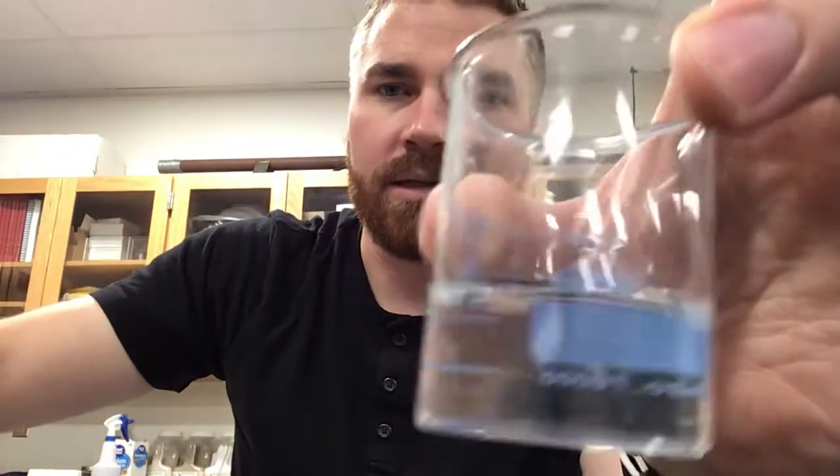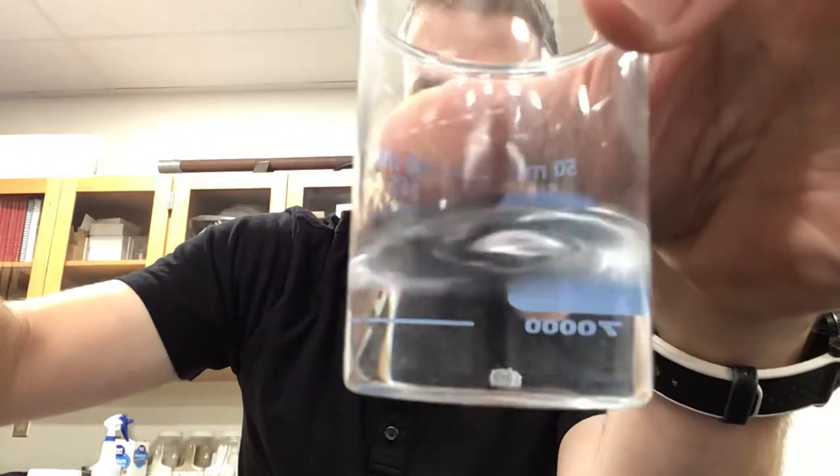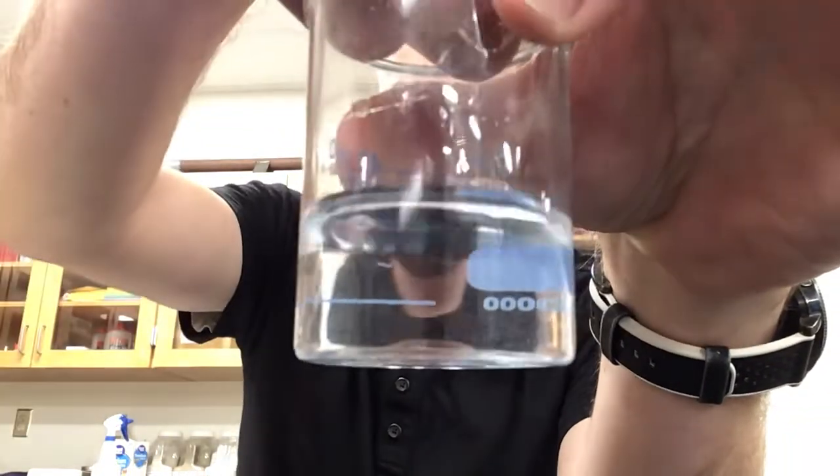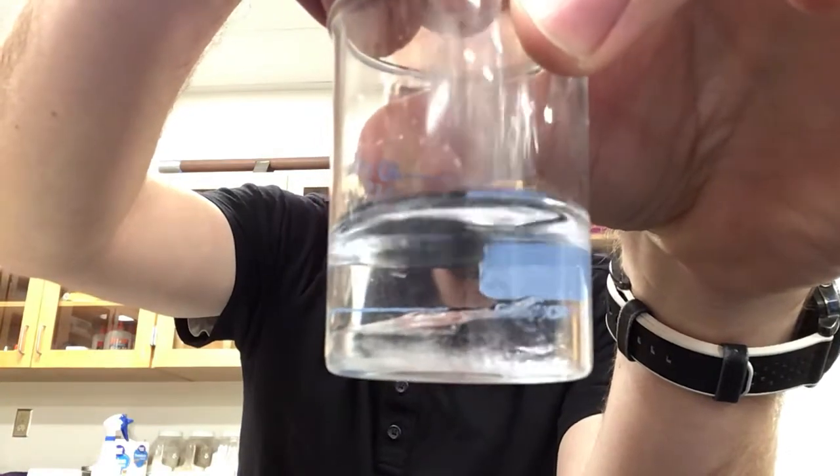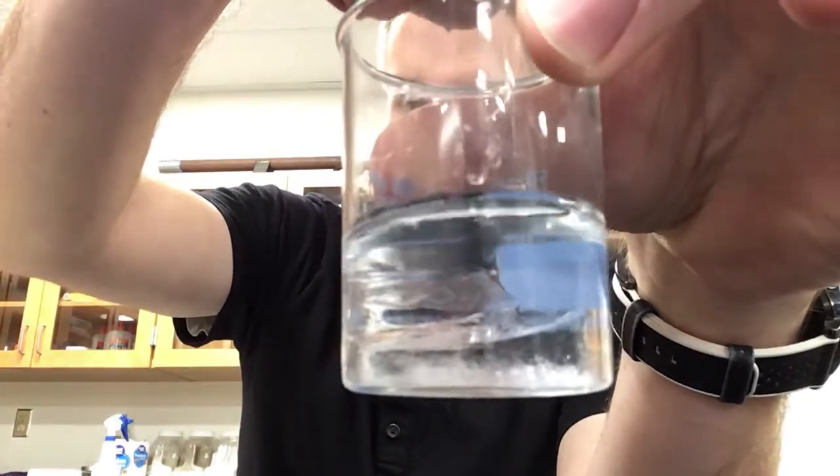But to know whether it is water or not, we talk about how we could know that. And we end up saying, well, ice floats in water. So if it's water, then the ice will float. Well, let's give it a shot and see what happens. Let me hold this here where y'all can see it. Put a couple of pieces of ice, and you can see right there already this ice does not float.